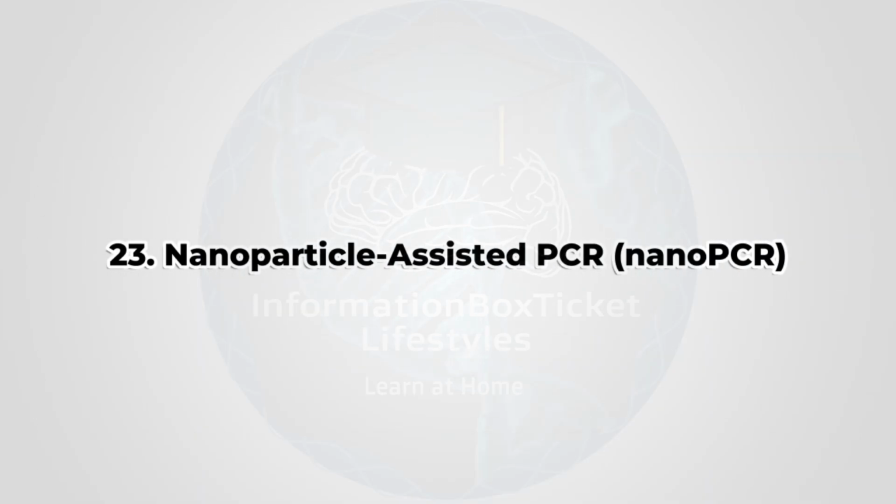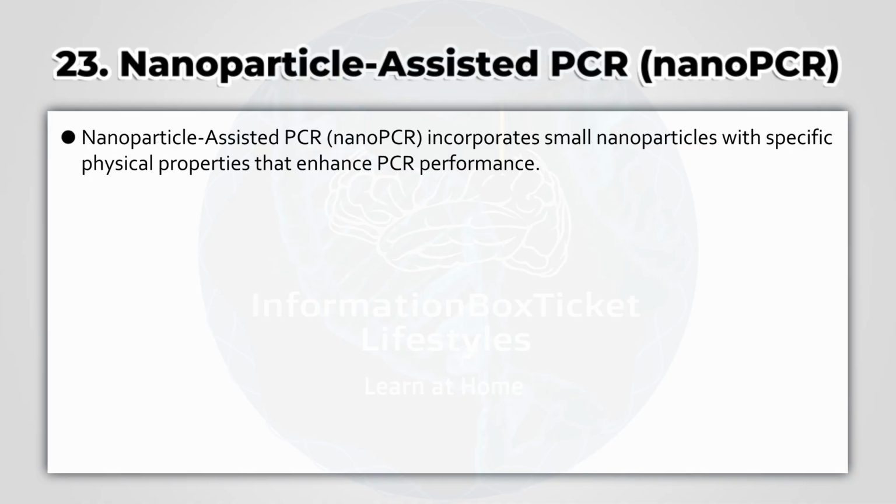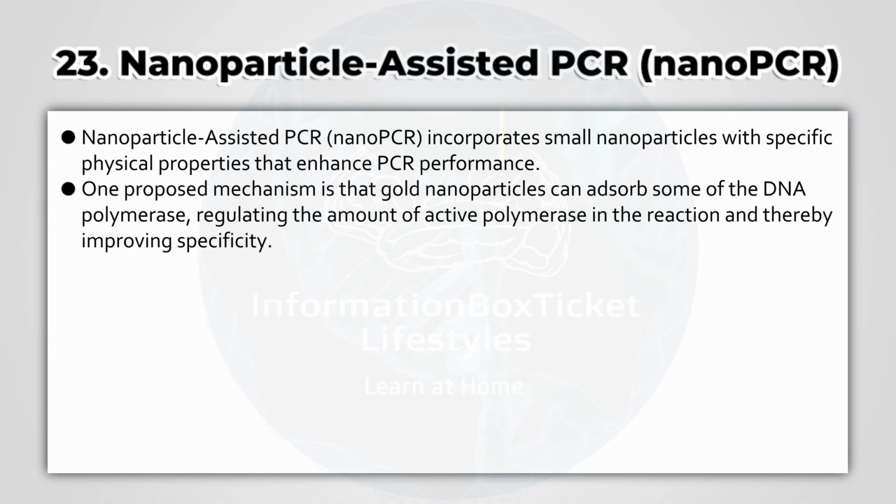23. Nanoparticle-Assisted PCR, nanoPCR. Nanoparticle-Assisted PCR, nanoPCR, incorporates small nanoparticles with specific physical properties that enhance PCR performance. One proposed mechanism is that gold nanoparticles can adsorb some of the DNA polymerase, regulating the amount of active polymerase in the reaction, and thereby improving specificity.